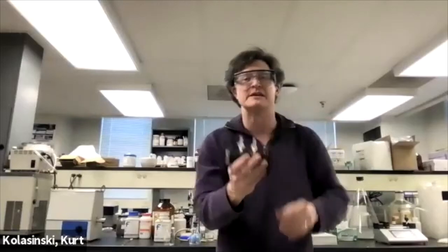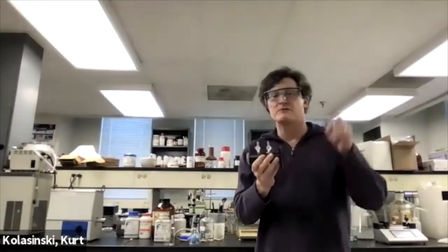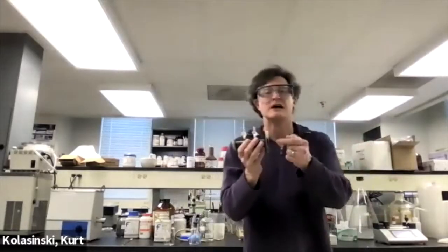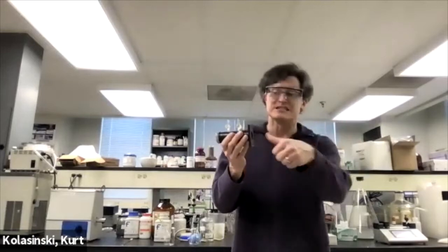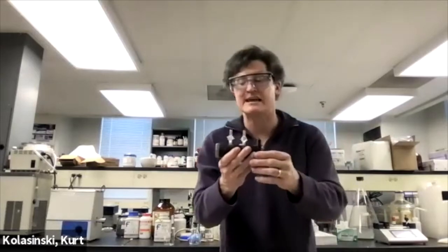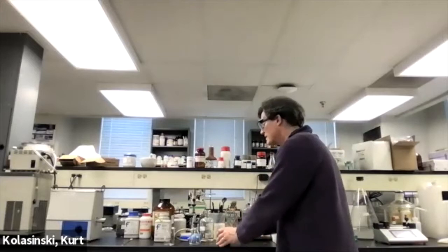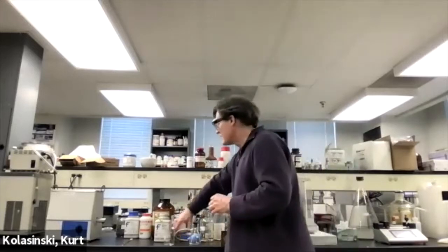So normally we would take this cell and keep it in the desiccator over here, right? We got to keep it in the desiccator to keep it away from water. Humid air messes with those, just like your fingers will mess with them. Make sure you keep the windows dry, all right? So normally it would stay in a desiccator. Right now, we're going to have to fill it up with our HCl. We're going to have to generate some HCl.